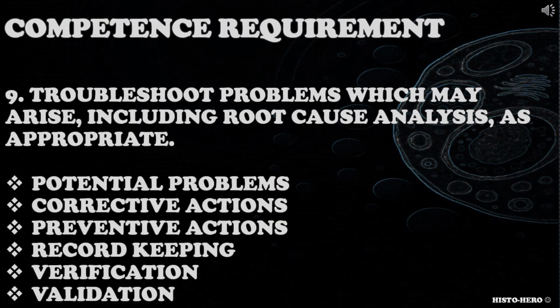When addressing this competence requirement, candidate could consider potential problems they may encounter, corrective actions taken, preventive actions, record keeping, verification and validation and so on.